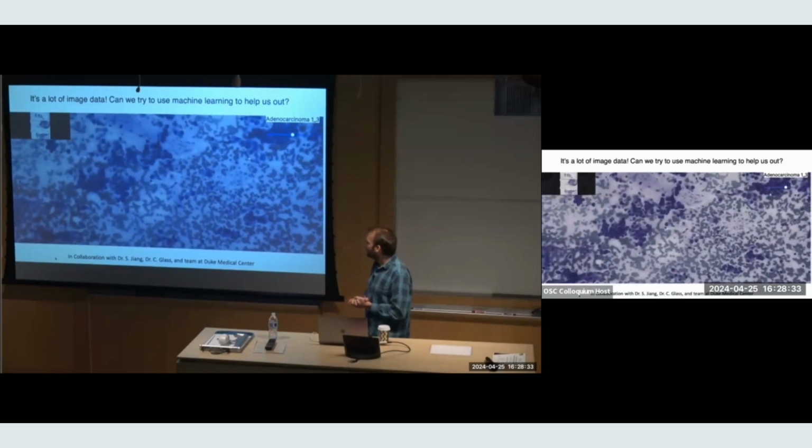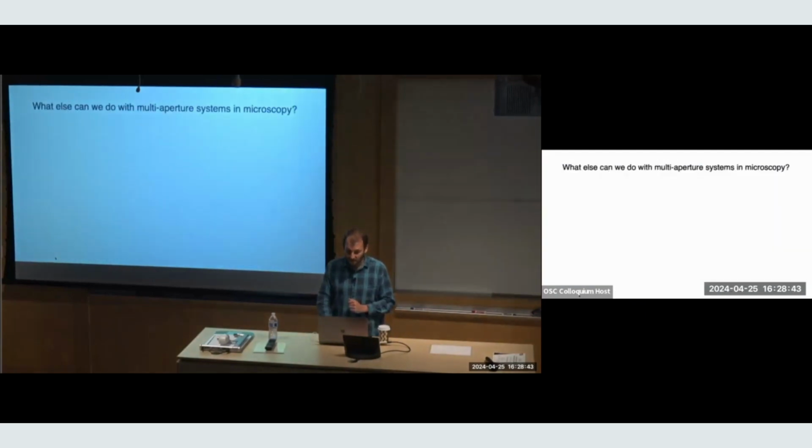So yeah, this is an ongoing project, like I said. We have one of these at the Duke Medical Center. We're scanning a bunch of slides to help with some of their workflow.